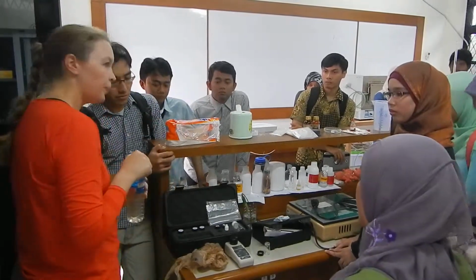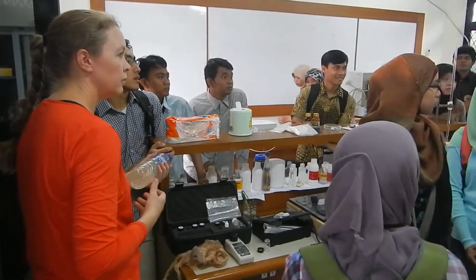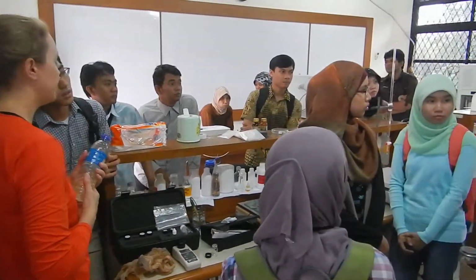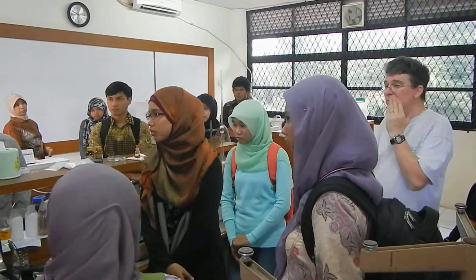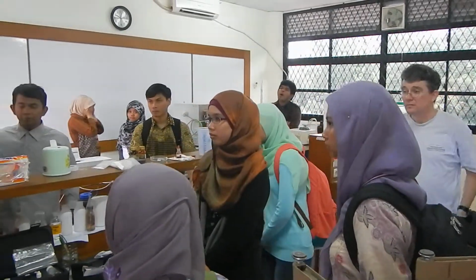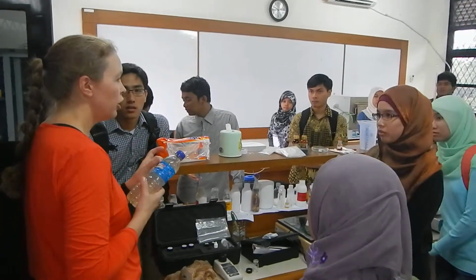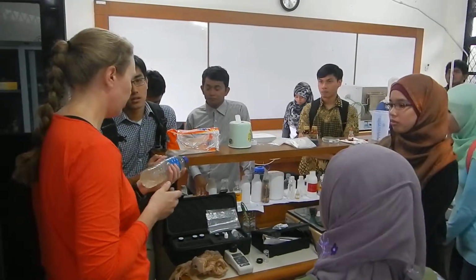Okay? And so I can preach about why you need to calibrate, because we didn't calibrate the turbidity sensor. We left it out, and what can happen is, for example, algal films grow because it's an optical sensor, and so you get a bias in your readings if you don't clean your sensor. Right. So biofouling is very important, something you have to deal with. So look at what the manufacturer recommends and watch the system you're in. If you're in a system with really high algal growth, you may want to do it every week. If it's not so much, you maybe will do less. So you just kind of need to watch that.